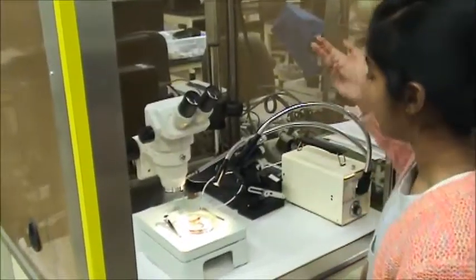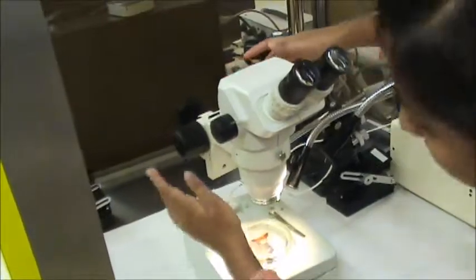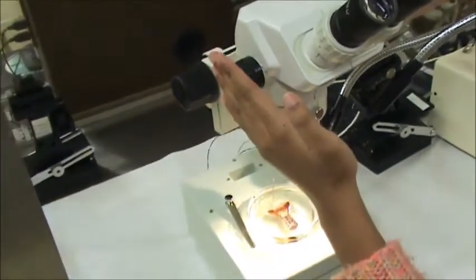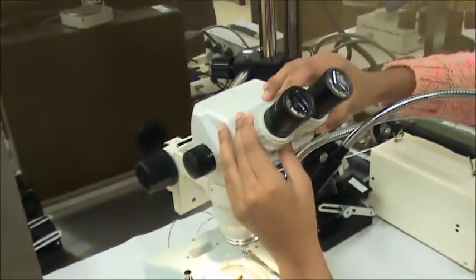This microscope actually has a boom stand, which kind of helps you move around a little bit. And here's the focus knob, here's the zoom, and these are the eyepieces to adjust to your own eyes.